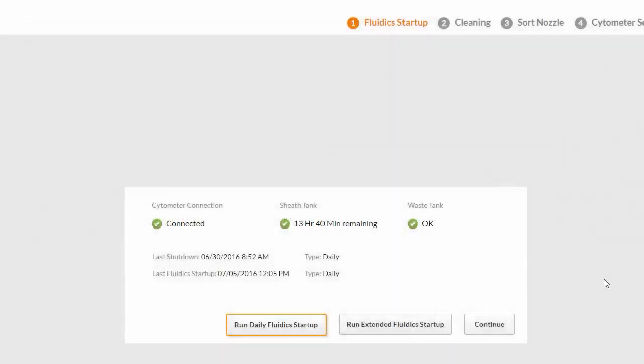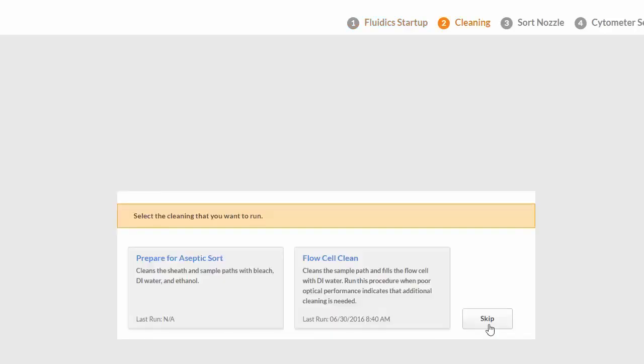Click Close and then Continue to view the cleaning options. This procedure can be skipped if a cleaning was done as part of the shutdown.